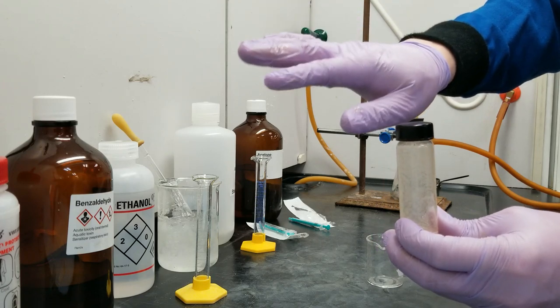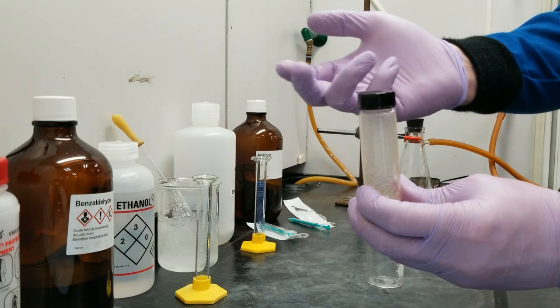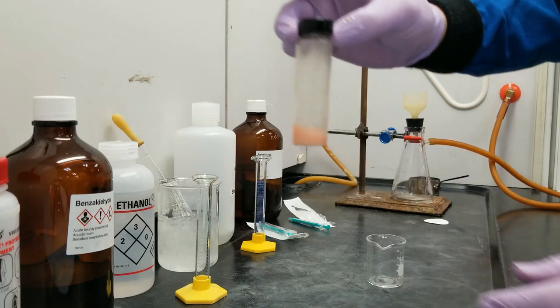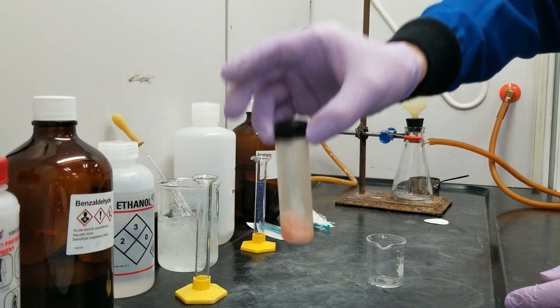My gloves actually got a little bit wet because as pressure built up along the rim of my container, the liquid pushed itself out. But you can see how cloudy it has gotten and how the sides of the container are actually plastering the solids.